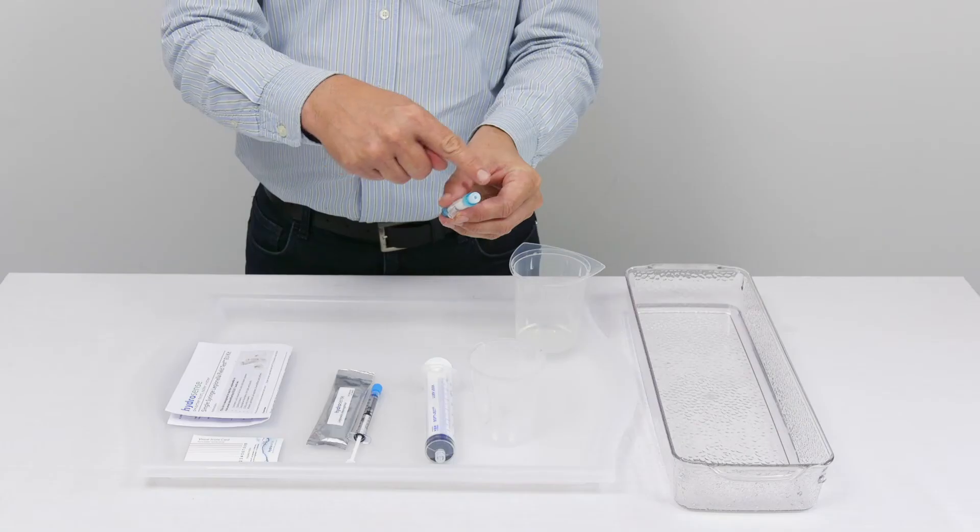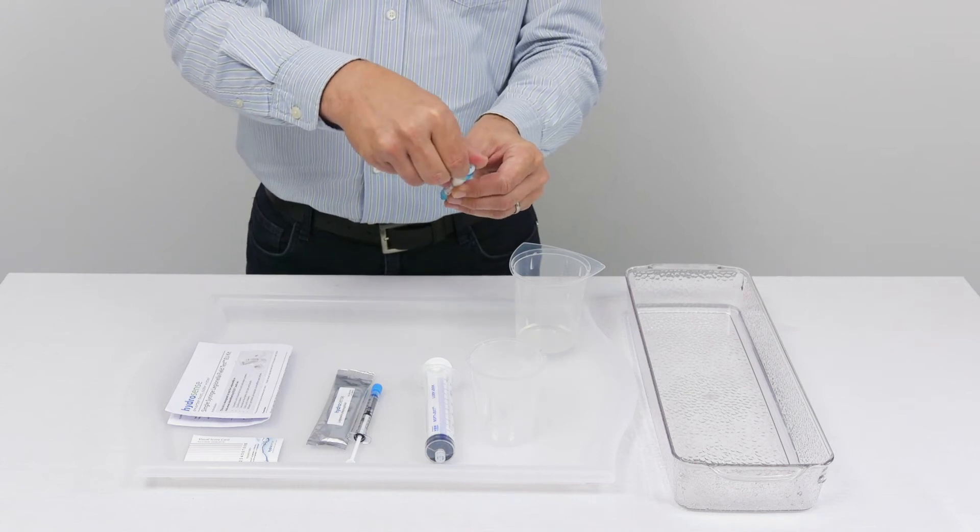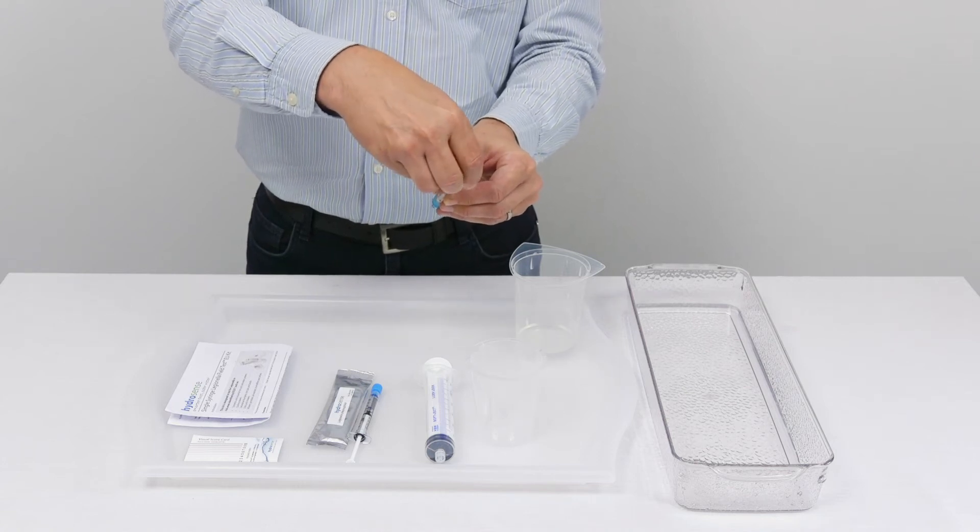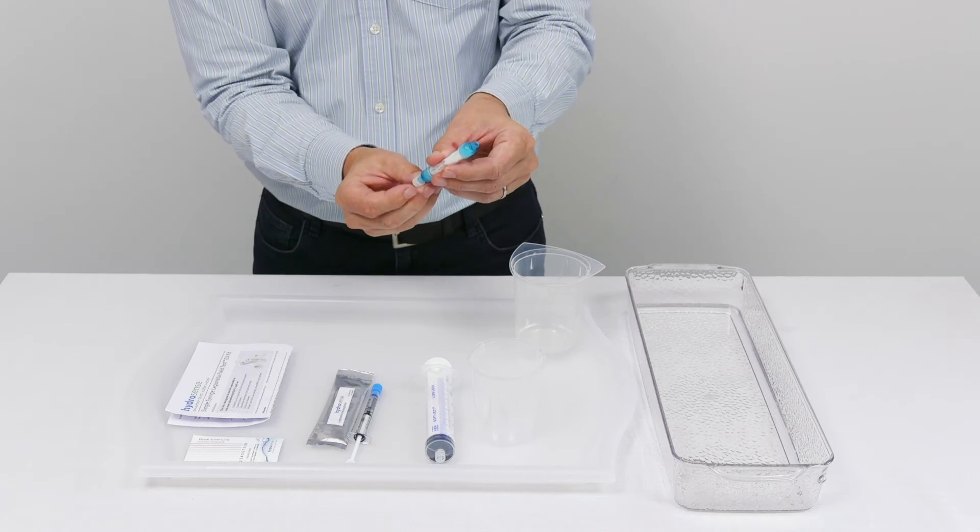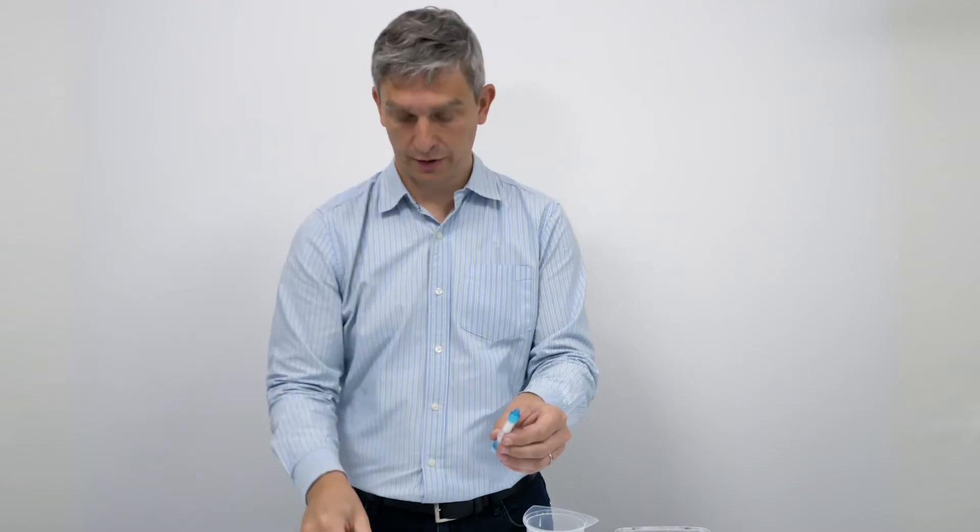The majority of the bacteria will be collected at the top end of the filter, so in order to maximize recovery, we take the top cap off, place it on the bottom, and then get access to the samples that are at the top.